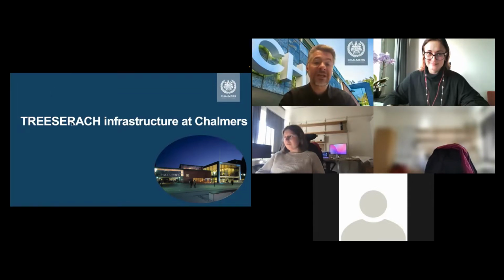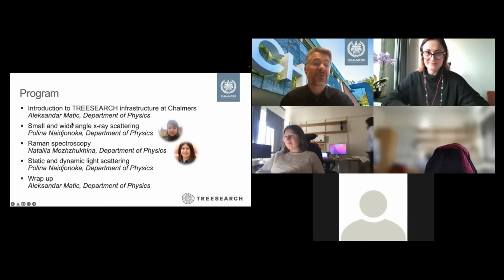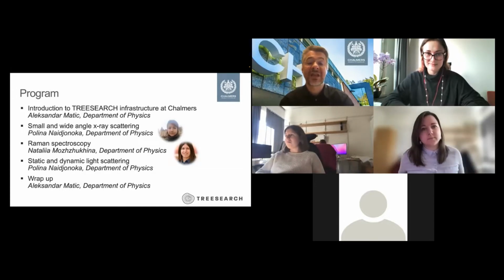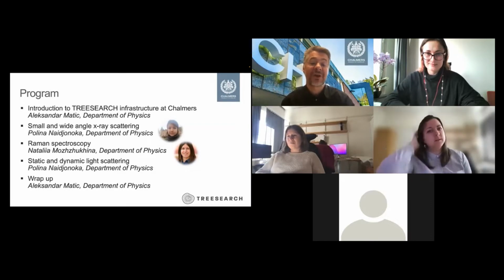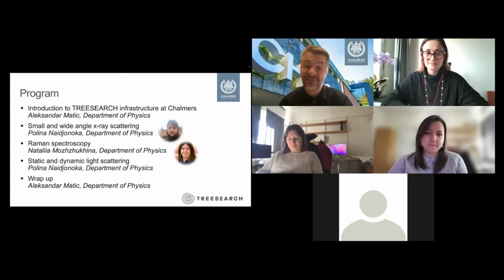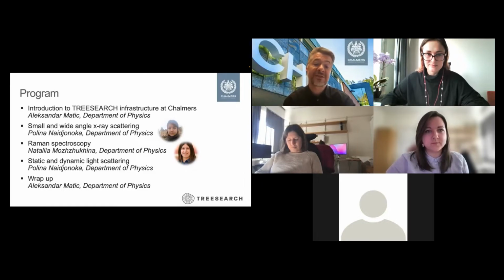We put together a small program for you to introduce the infrastructure. So I will first make a little bit of an overall introduction of what we can offer at Chalmers and also what you can expect from us. Then we go into details in three of the techniques, the three main techniques that we offer. So small and wide angle X-ray scattering. Polina Naidjonoka will introduce this for us. Raman Spectroscopy.